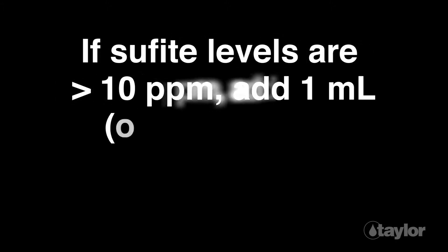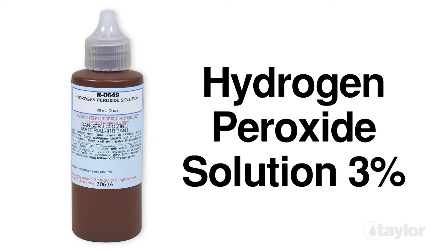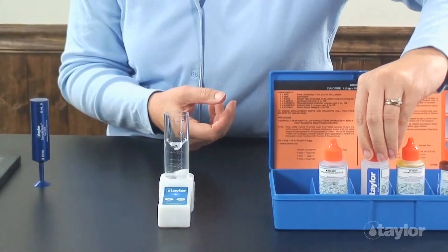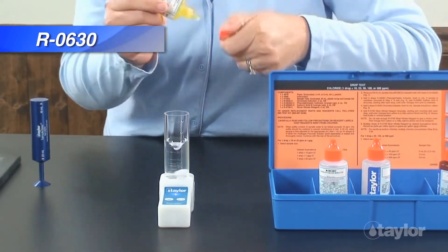Note: if sulfite levels are thought to be over 10 ppm, the sulfite must be oxidized to prevent any interference. Adding 1 ml, or 25 drops, of hydrogen peroxide solution 3% — which is sold separately — and then mixing it thoroughly will oxidize the sulfite. Add 5 drops of chromate indicator, swirling to mix. The sample will turn yellow.